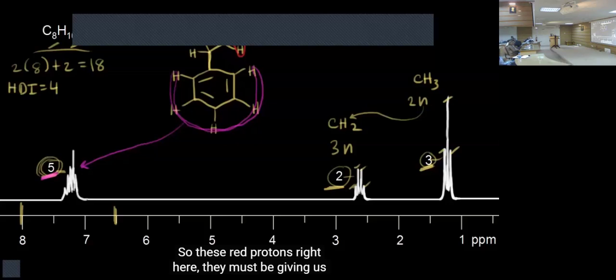That's why integration is important. That's why I told you in the previous example that NMR people are technicians. They just do it by their experience of thousands of NMRs they have done, but they are not sure. Except Abdul Mateen, because he has done it absolutely.